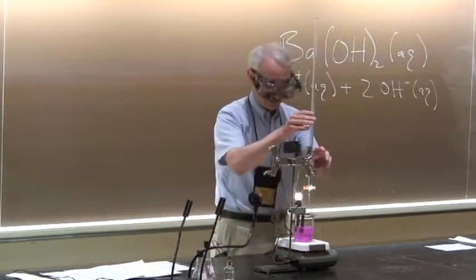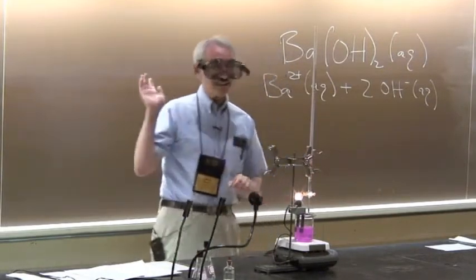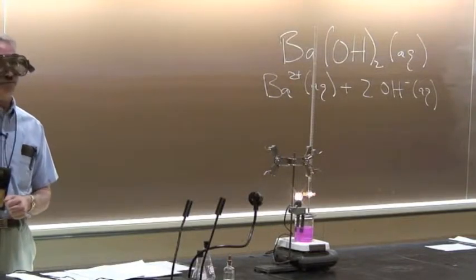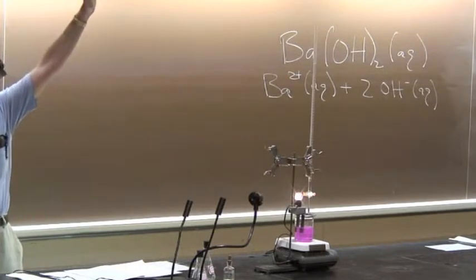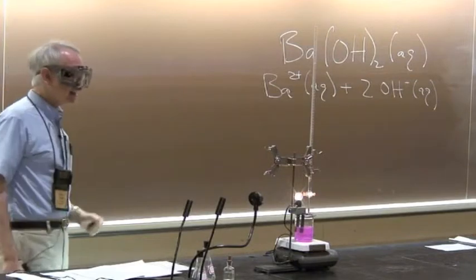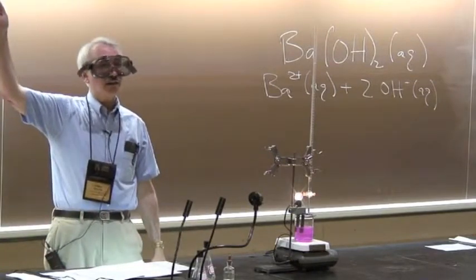How many think, I'm only adding a little bit, how many think the light will go out? And how many think the light will not go out? And how do you think the pink color will go away?